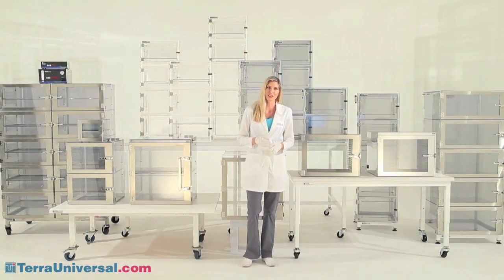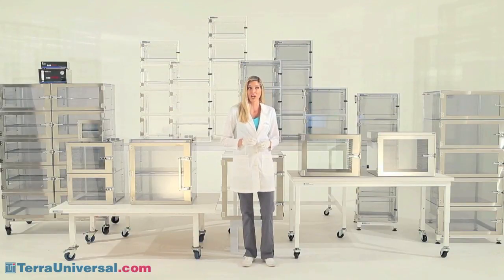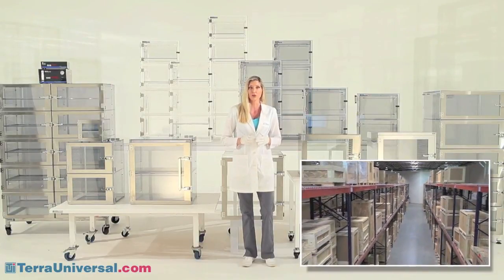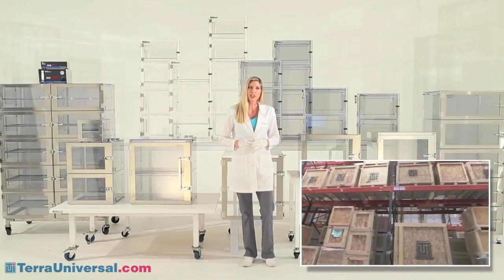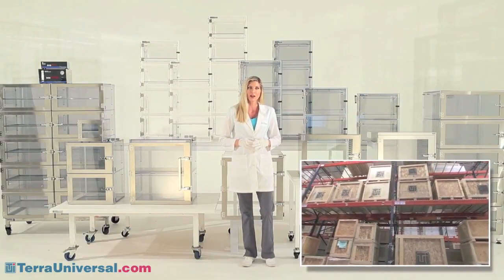As you can see, Terra offers a wide selection of desiccators and configuration options. Terra stocks dozens of these models for next-day shipping at its Fullerton, California manufacturing facility. To order or for more information including pricing and lead times, visit TerraUniversal.com.